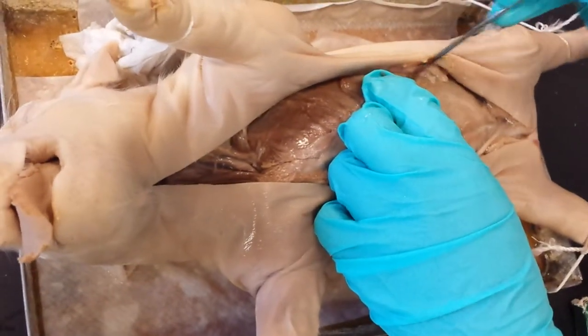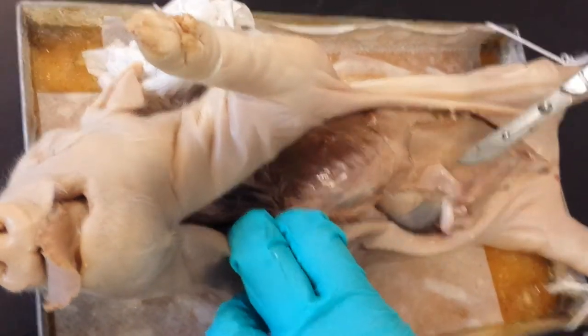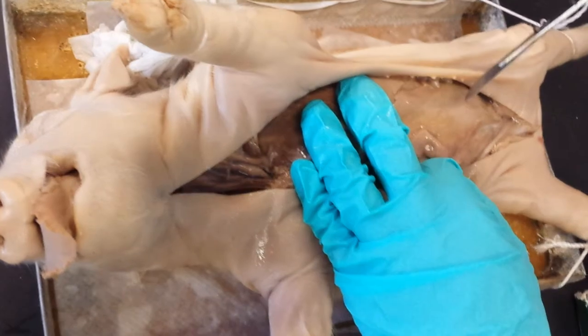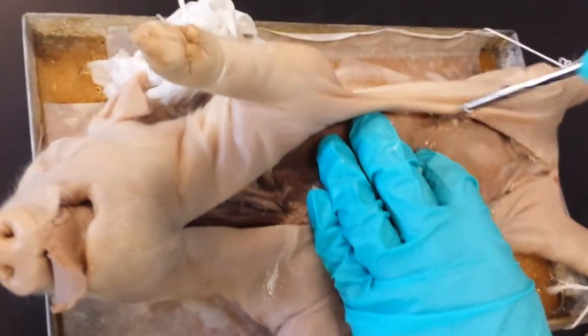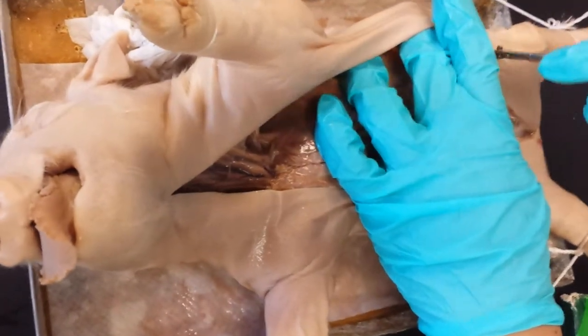Doctor, what do I do next? I don't know. And locate the liver. Yeah, no, I asked you what the cavity lining was, and you never gave me an answer. No, because that's all it's saying. Step it up, doctor. Doctor, we need to save this pig's life.